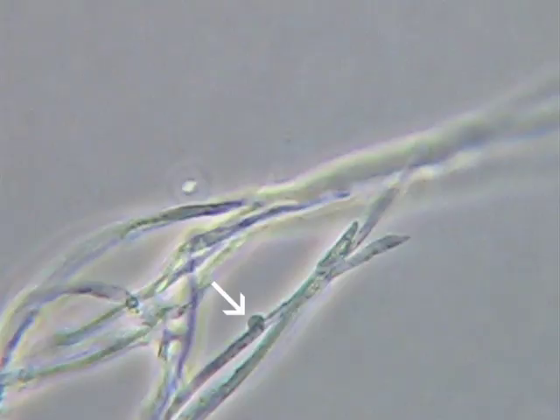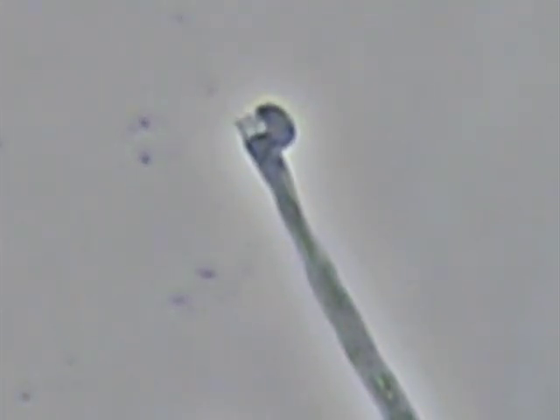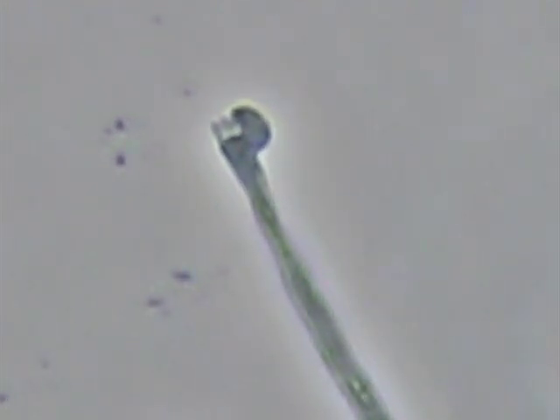Now we'll take it to a compound microscope. Here's what we see — that little bump where the arrow is located is a clamp connection, which is typical for the basidiomycetes that cause fairy ring. Here's another look at a piece of mycelium that has been broken off, and you can see the structure of that clamp connection. Refer to the links associated with this update for additional information on management and control of fairy ring.